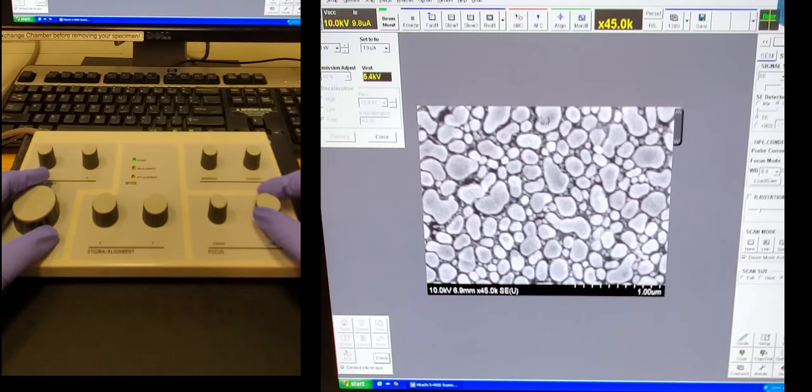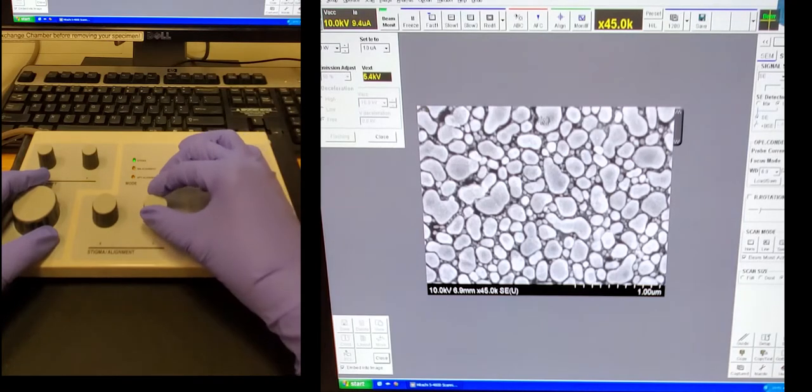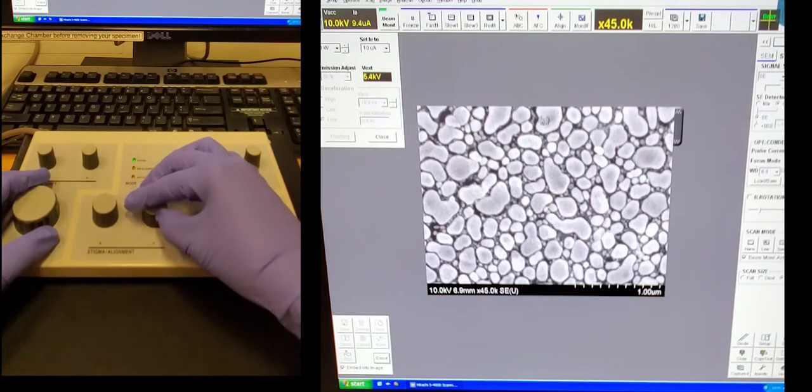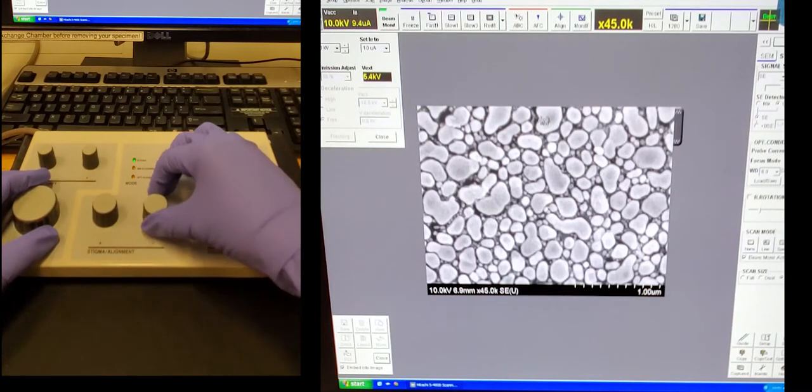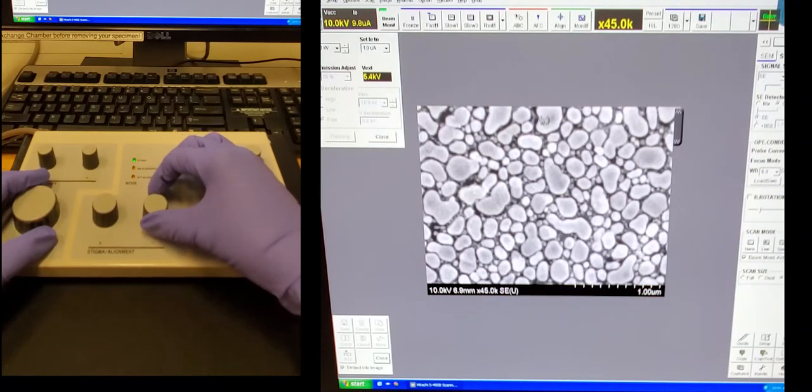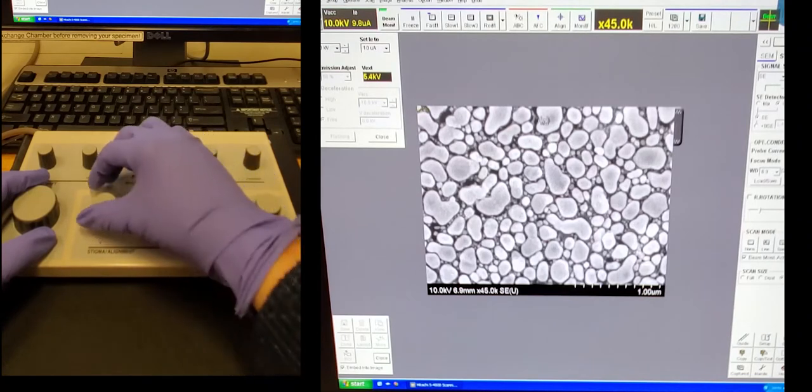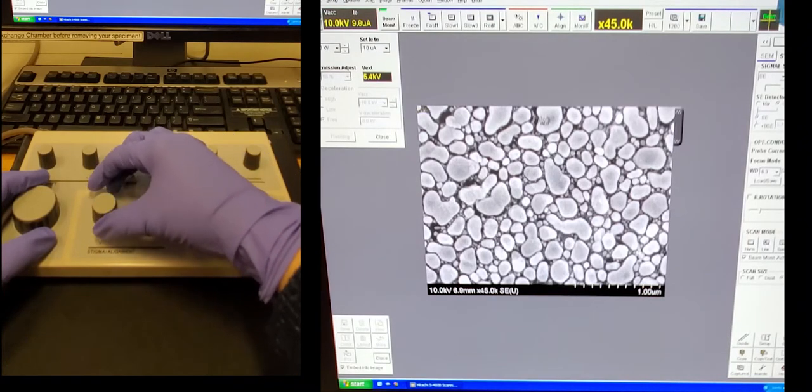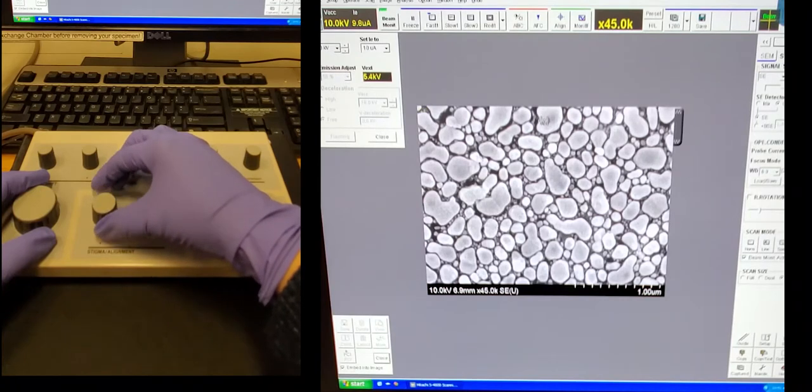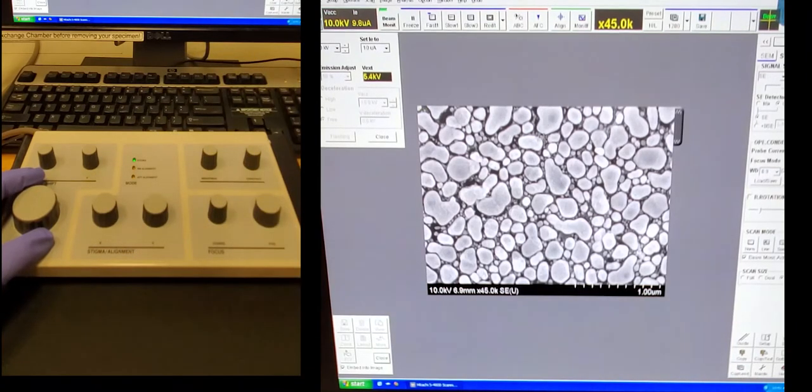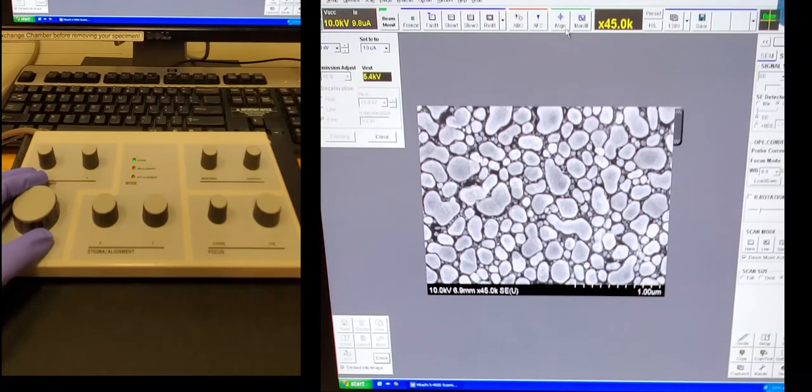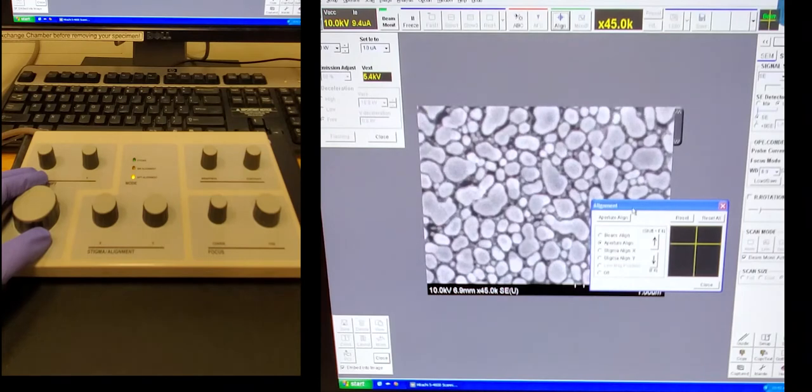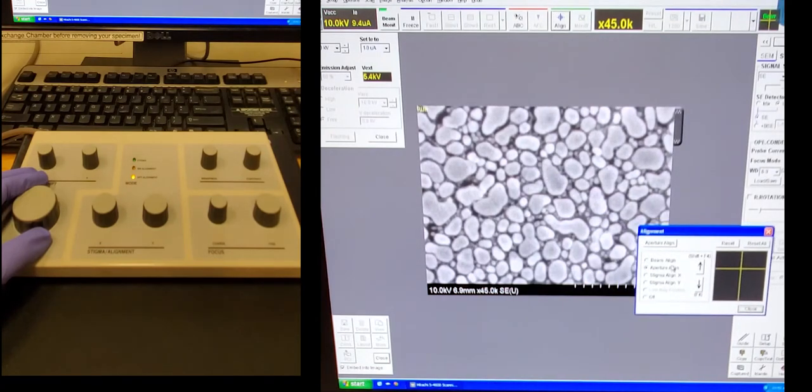And this button on the right is the fine focus. So when you go to high mag, the fine focus is easier to work with than the course. Checking the stigmatism again. So how to check the stigmatism? You turn it one way until the image gets worse, then you go the other way, it'll get better, and then if you keep going, it'll get worse again. So that can help you find the best position.